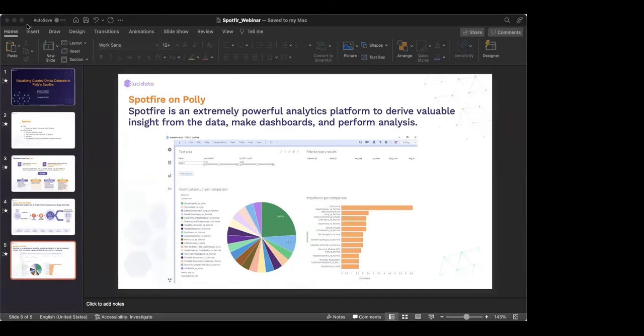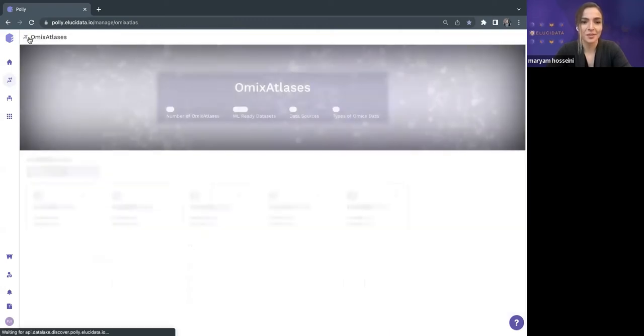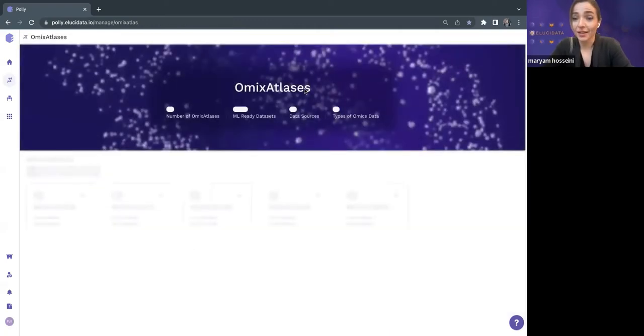A quick, yep. I think you've not navigated to Poly. Could you do that? Oh, maybe you cannot. Okay, maybe you cannot actually. Let me stop sharing and reshare it again. Thanks for letting me know. Okay, I should go back probably. Okay, yeah, thank you very much.